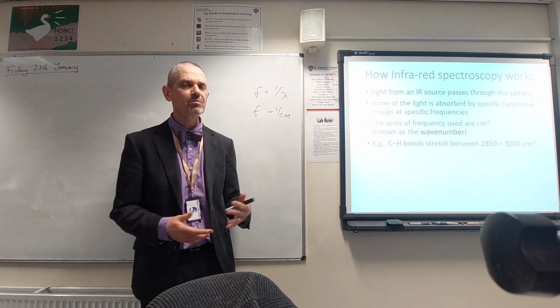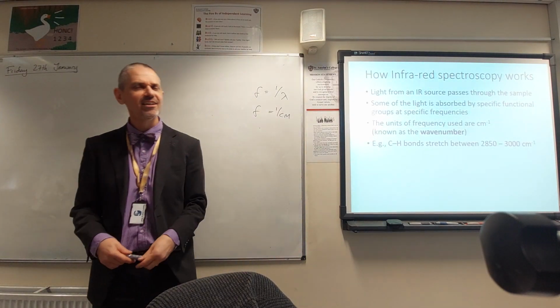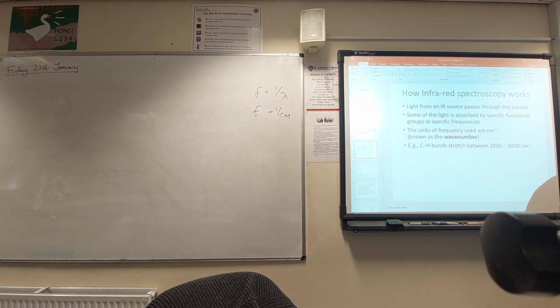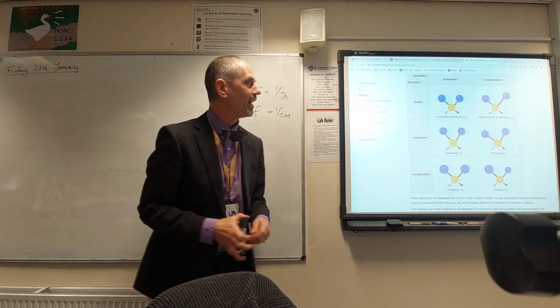So you're going to see that quite a lot, given that almost every organic molecule has some CH bonds in it, right? But just before we go on and look at the spectra themselves, let's have a look at this rather fun page of Wikipedia.